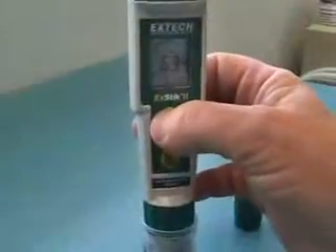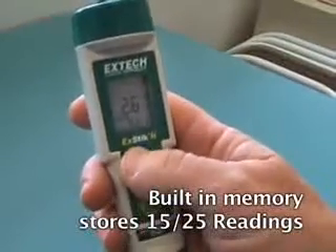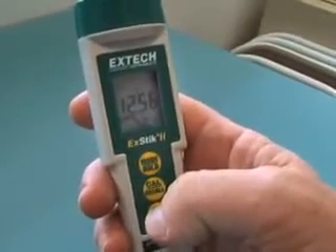The internal memory allows for data recording of up to 15 or 25 readings that are labeled sequentially for easy recall. This feature eliminates the need to bring samples back to the lab — it not only saves time but provides maximum accuracy for on-the-spot data recording.